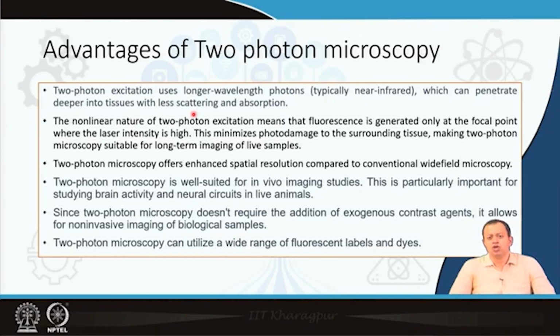So, let us take calcium ions. There could be certain fluorophores which are made to tag with calcium ions only, and these fluorophores work on a nonlinear principle, i.e., they will absorb two photons and will emit one photon out.